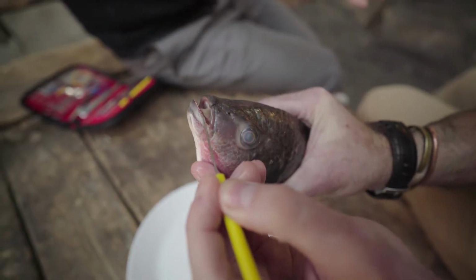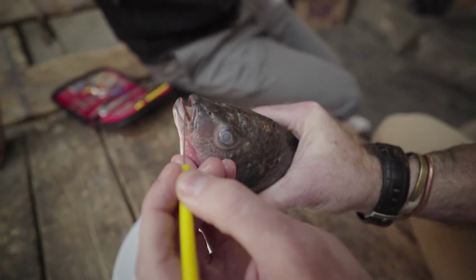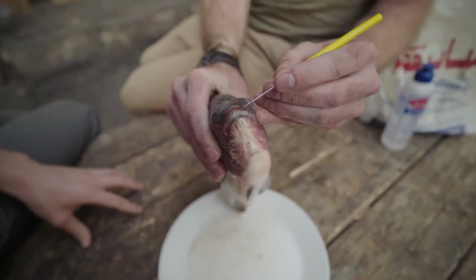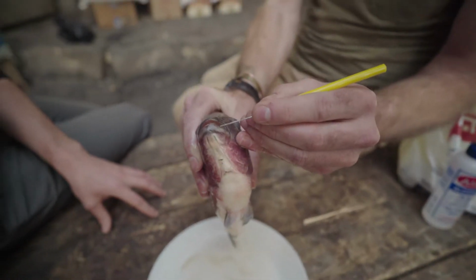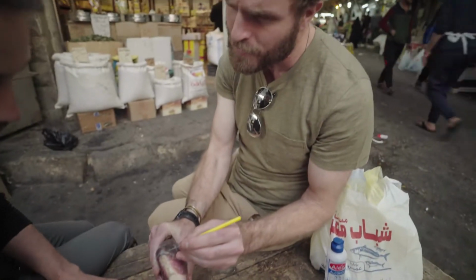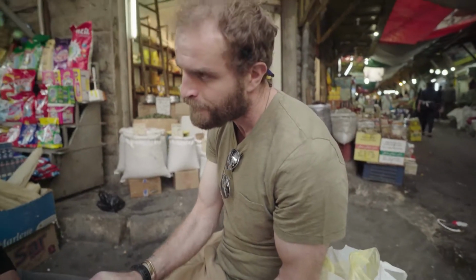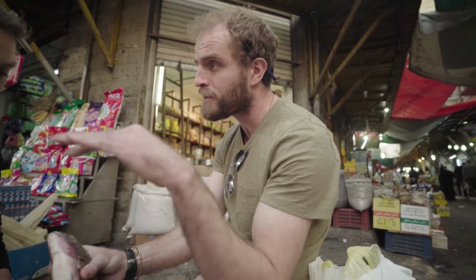They're not sharp teeth. It's not like a shark's sharp teeth. So I'm gonna say that they eat little plants and maybe little things floating around. Exactly. So this animal does not eat fish. It is not a predator. This animal is a herbivore. Mainly a herbivore. It might take the odd small insect if it can get it. But mainly it's going to eat plant material. Algae or plants growing in the water, floating in the water, floating on top of the water.